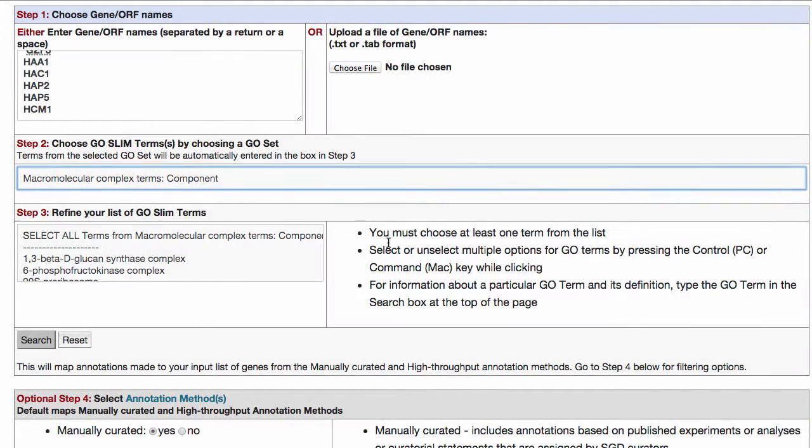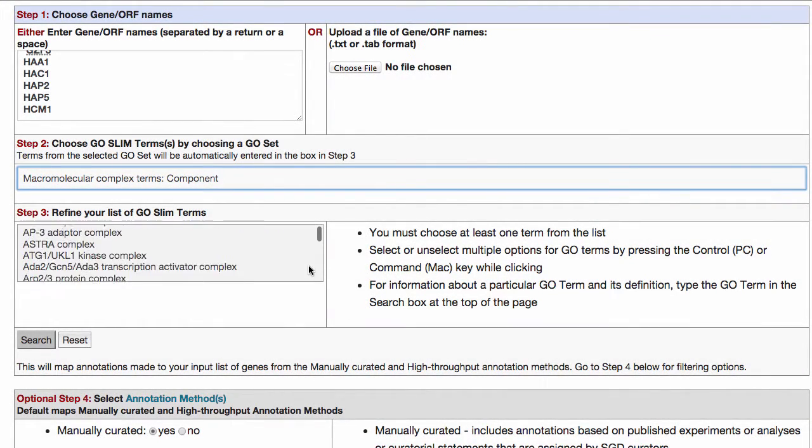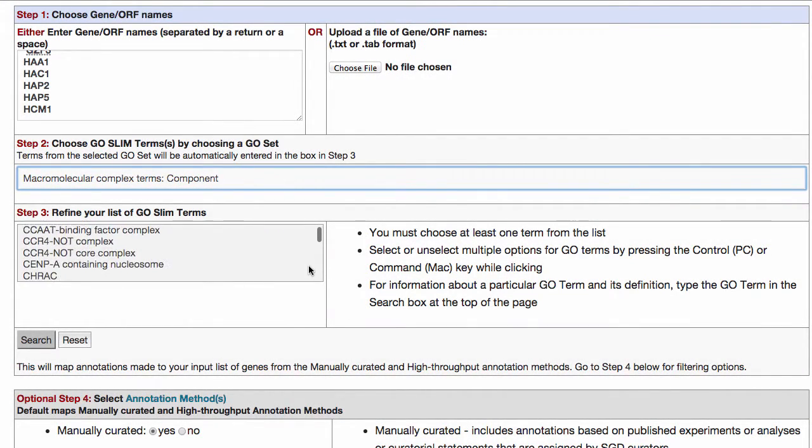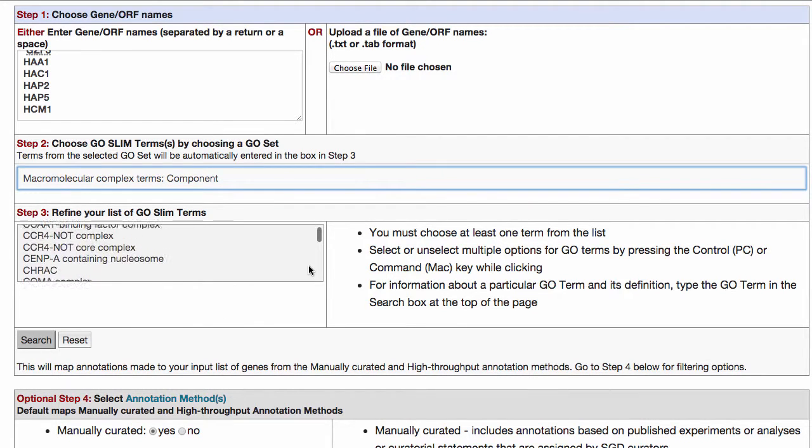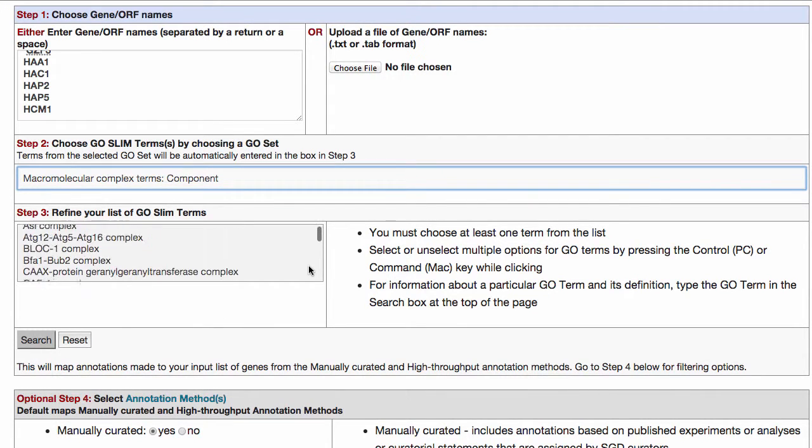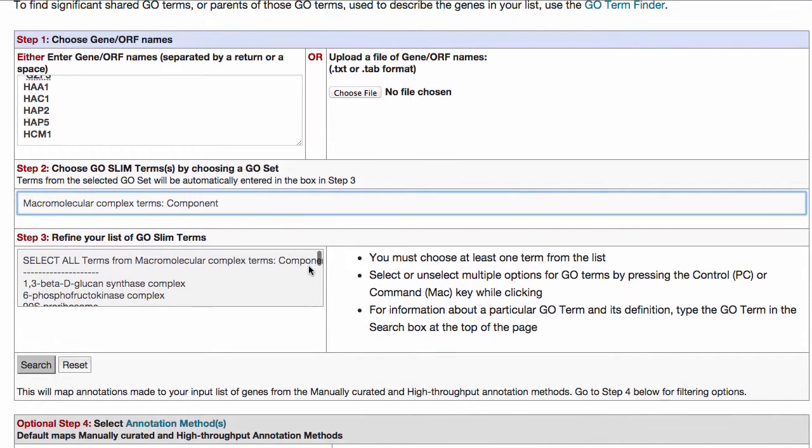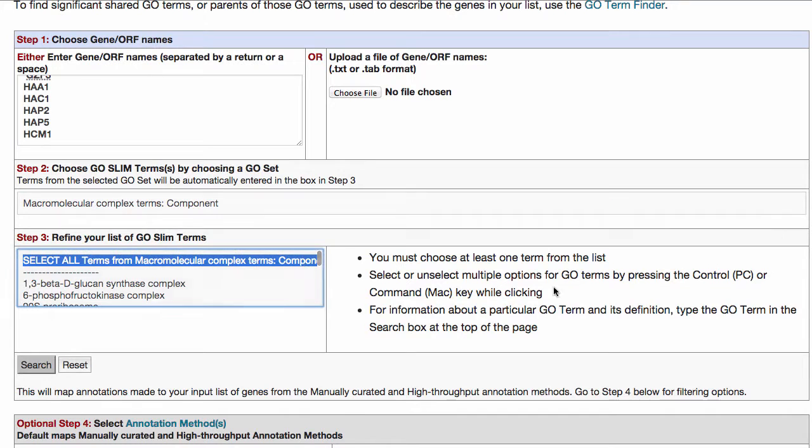Step 3: Refine your list of GoSlim terms. If you don't want to use all the terms in the GO set you selected in Step 2, you can refine or limit your list of terms to use only the ones you are interested in. If you do want to use all terms, just click Select All.